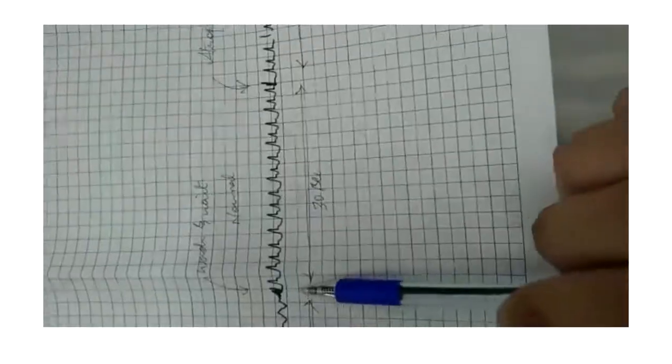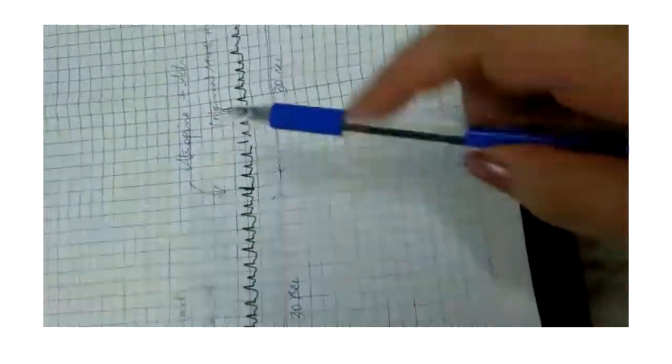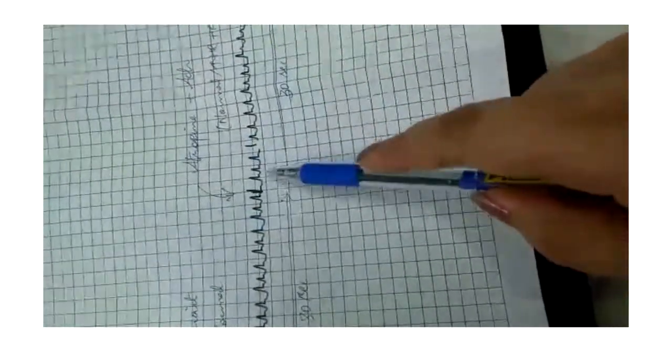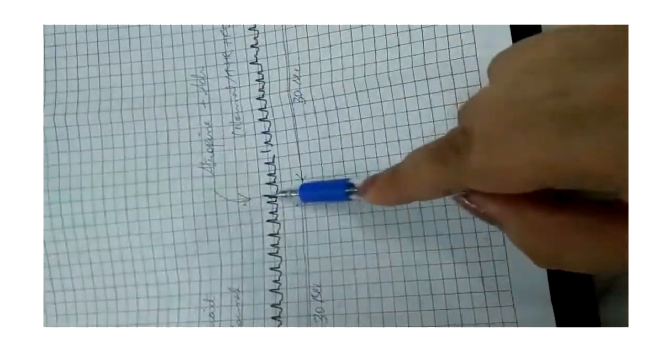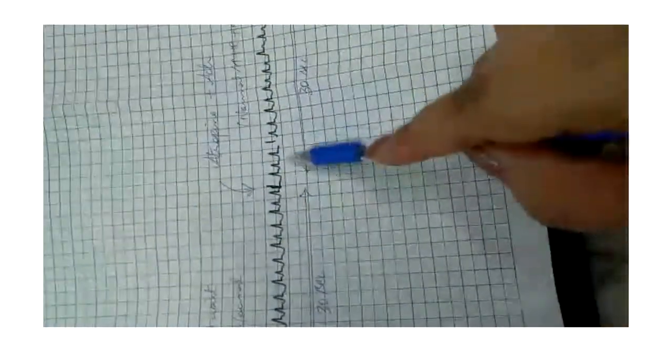So now you will wash and wait for some time, and then after taking normal reading, we added atropine, the antagonist of acetylcholine, along with unknown drug. This reading proves our assumption that this was acetylcholine, because atropine is blocking the effect of acetylcholine. Got it?